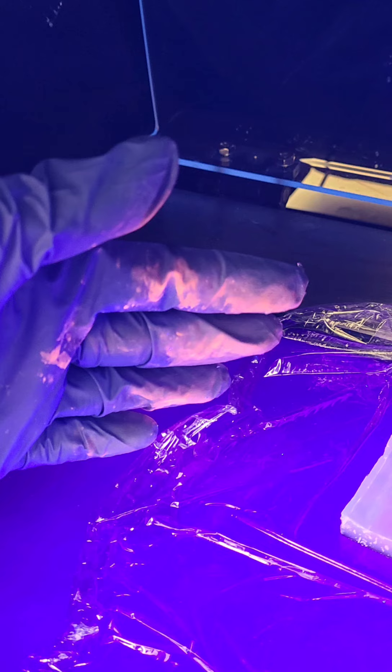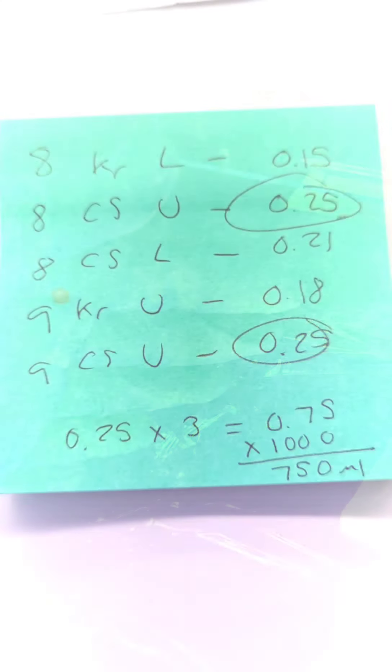I'm not 100% sure why my hand is glowing under the UV light, but science! The gel extraction protocol is quite simple. First, we weigh our tubes and determine which one weighs the most. We will then use that value to calculate how much buffer and isopropanol we need to add later on.